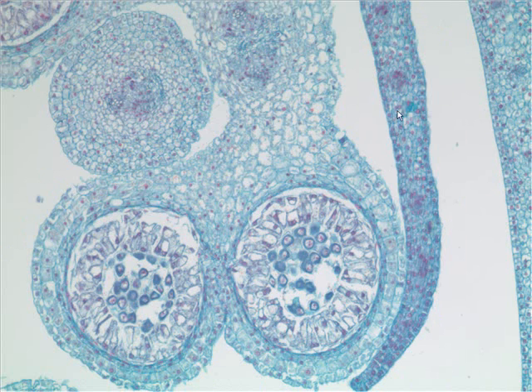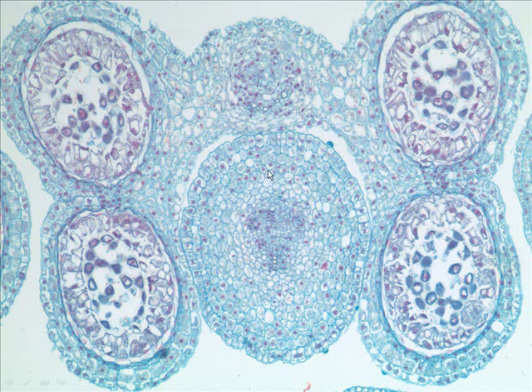And now we see to the right the two petals, and now we have the anther more complete, not the total anther, but most of the anther, and two sacs here and one sac up there. What's this? That's the what? The filament. Here's an entire anther with its filament, and so this outside part, of course, is the anther with its how many pollen sacs? 4. And this is what right here? The what? The filament. So anther and filament, they together comprise the what? The stamen. Yes, the stamen.